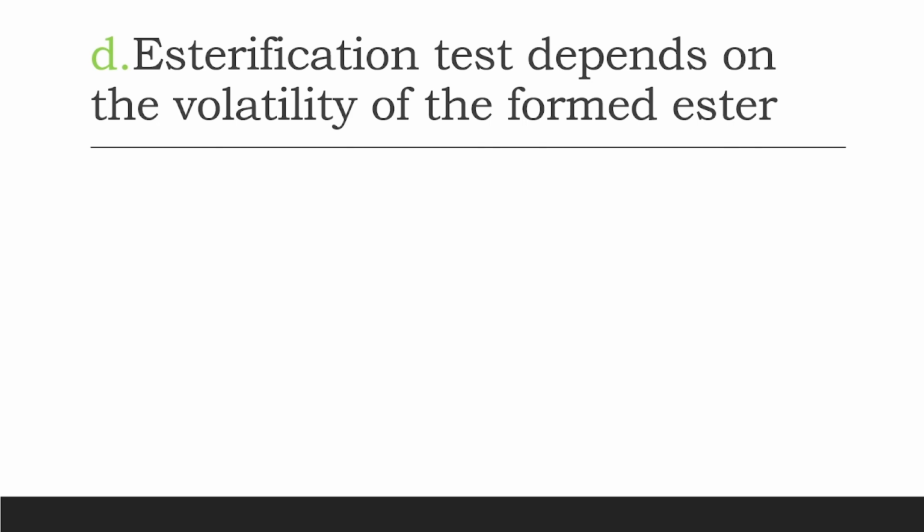Here in the esterification test we use methanol and we do not use ethanol. The reason behind it: number 1, methanol is more volatile, and number 2, ethanol itself has a sweet smell.